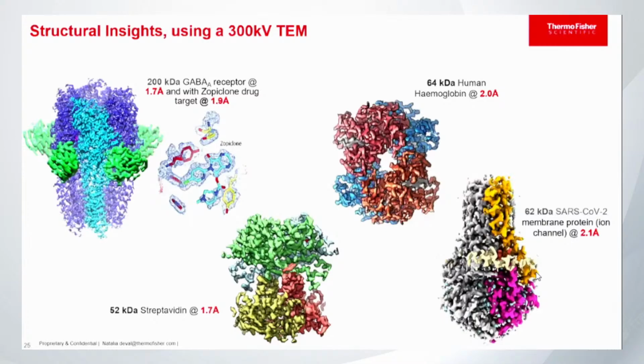The limiting resolution is always, in theory, double the pixel size. So if you are working with a pixel size of 0.77, if you double that, the maximum resolution you will be able to get is 1.5. Makes sense? So you play with that: high magnification, pixel size, and the maximum resolution you will be able to get. And of course, the pixel size depends as well on the camera you are using.